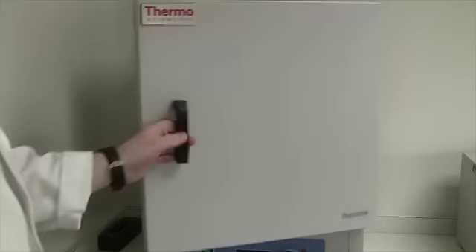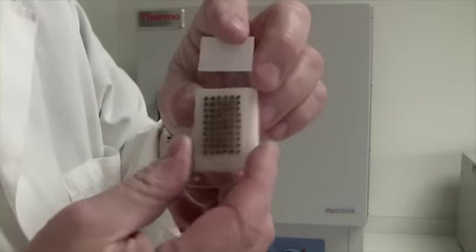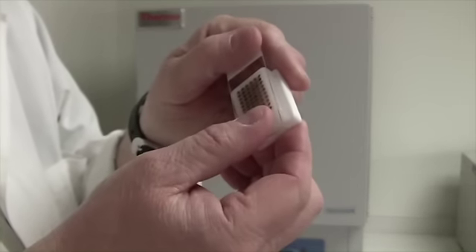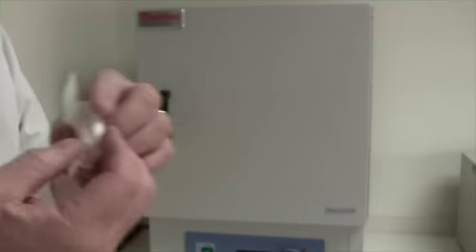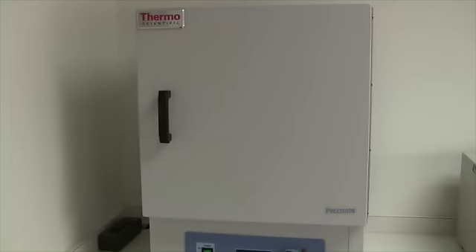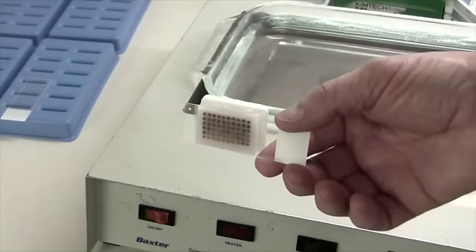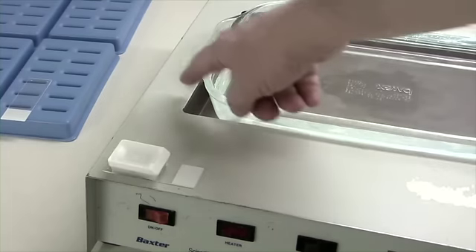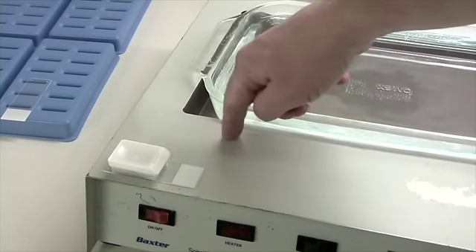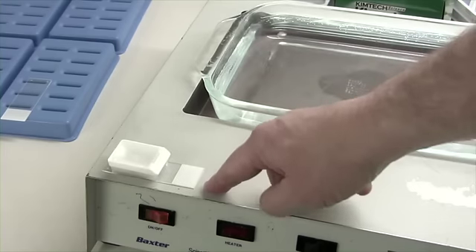Now you'll need to remove the paraffin block and slide from the oven, but don't separate them yet. You will need to heat up another slide around 70 to 80 degrees Celsius by itself. I'll explain why in a moment. Since I only have one oven, the array mold block still needs to stay warm and soft while this single slide heats up. I'm placing my array block on the side of my water bath. It's warm enough to keep the block soft while the single slide is heating up.